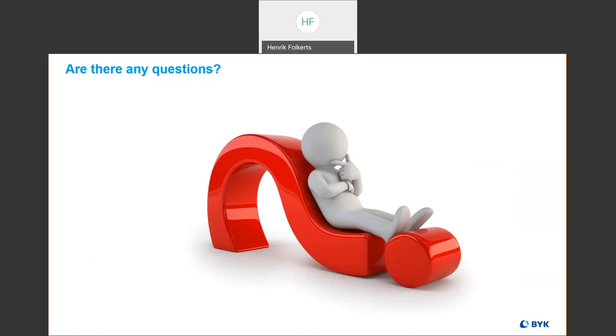And here you have both ISO and ASTM methods for testing. I'm wondering which exact method to select. Yeah, most of the time the specification is given. If not, you have to communicate with your supplier and decide on a method.